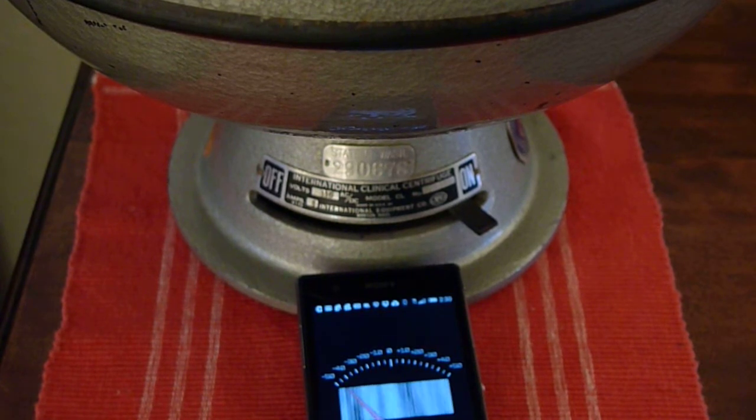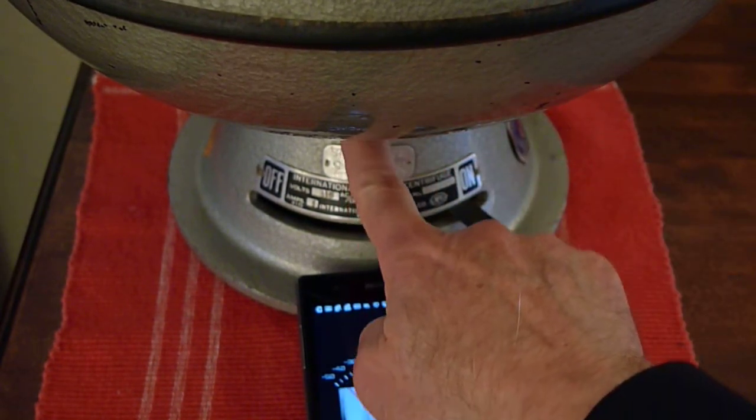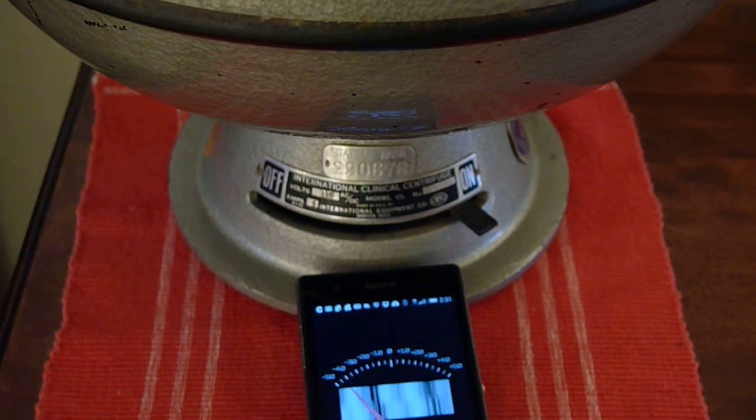If you find a manual on the IEC, it'll say that you should check the brushes on the motor. The brushes are in the front. I wouldn't check the brushes unless you had new brushes ready to go, because chances are if you actually need new brushes, you're not going to get the old ones to go back. So I'm just going to let mine run and hope for the best.